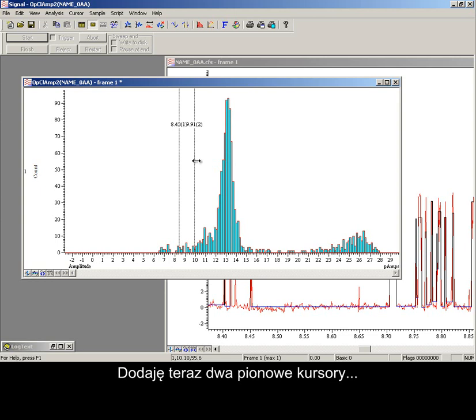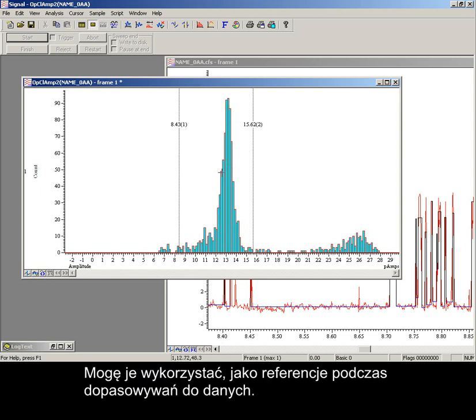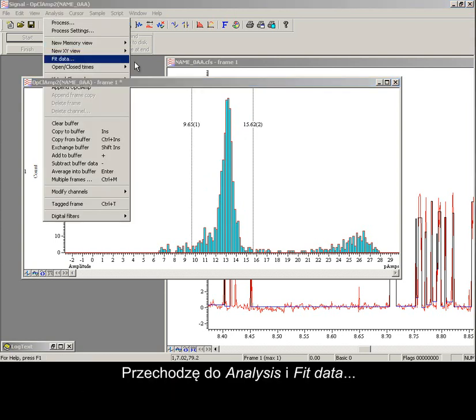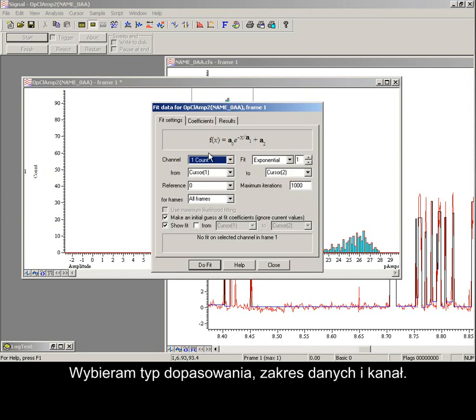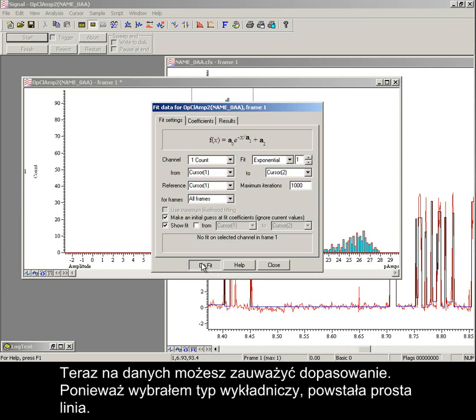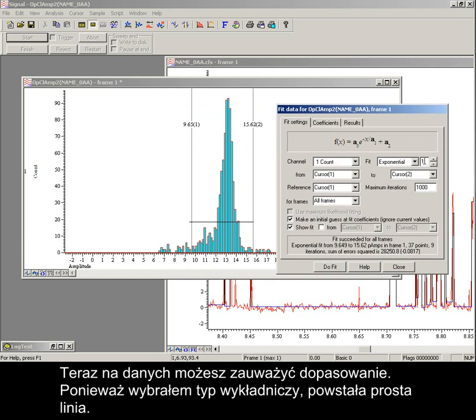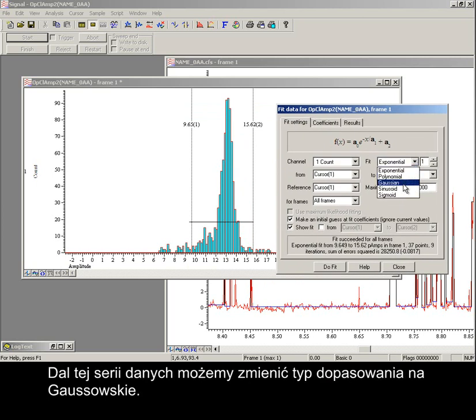Adding two vertical cursors now, I can use these as references for a fit to the data. To analysis and to fit data: select the type of fit, the range of data to fit, and the channel. Now you can see the fit drawn on the data. As the type of fit was set to exponential, it has produced a straight line. For this data series, we can change to a Gaussian fit.